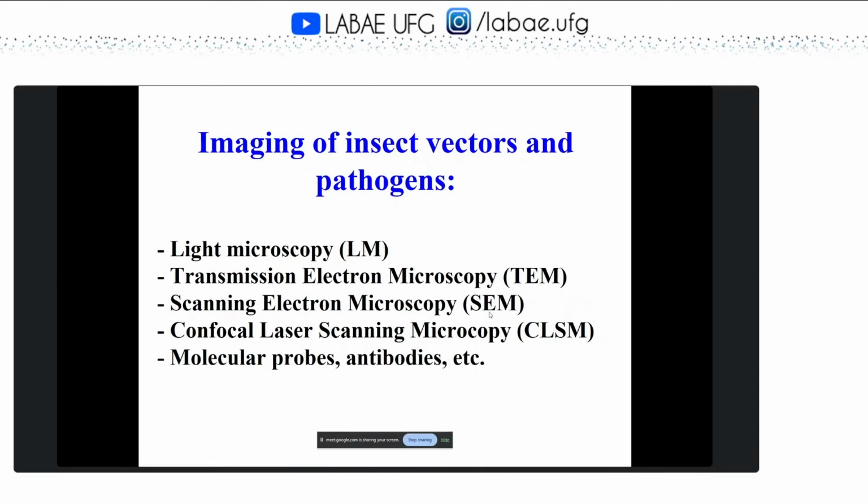Okay. So I will talk about those systems, and I was planning to put focus on imaging because we were using lots of imaging and microscopy in all of our studies. I want to convince you that imaging and microscopy techniques are not less important than molecular biology and all the other techniques we know. We use all of the molecular biology as well, but involving microscopy and imaging and molecular probes and antibodies is, we think, a much nicer and more productive approach that can tell you many things that you don't see in other techniques.